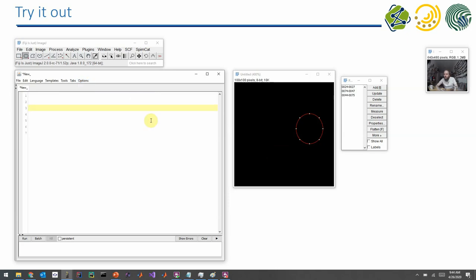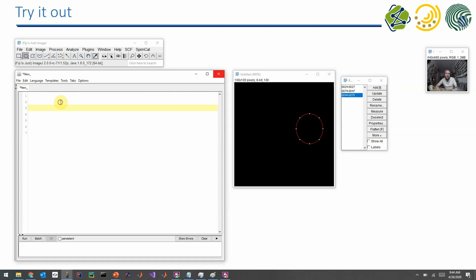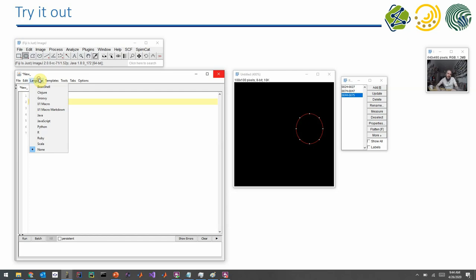And now I will add from the script colors to these ROIs. So let's assume that the list of ROIs in the ROI manager is a result of the particle analyzer. If you now want to put specific colors on these ROIs, for example to visualize their properties, we first of all have to select something in the ROI manager.